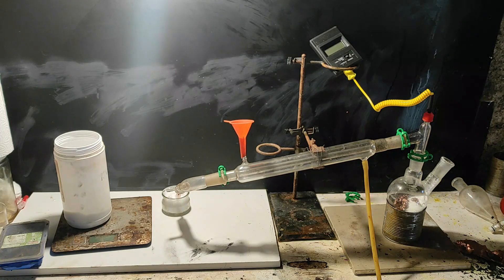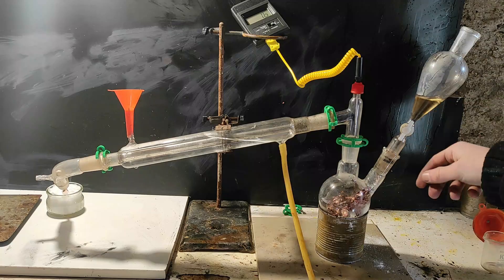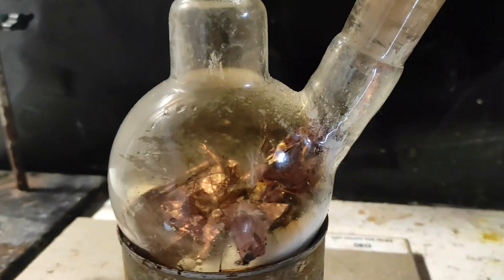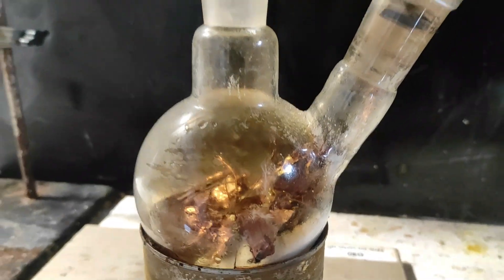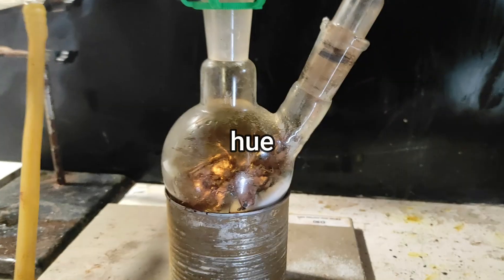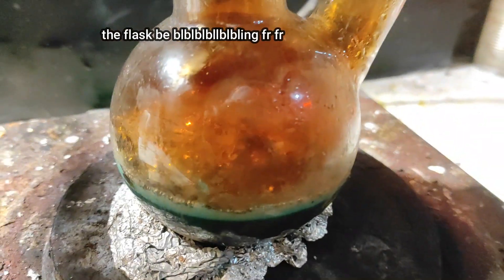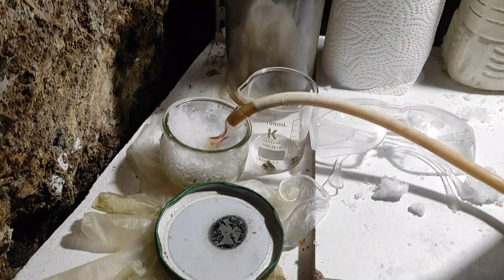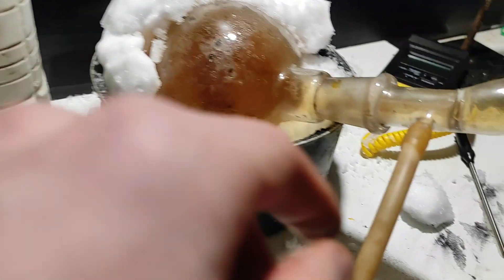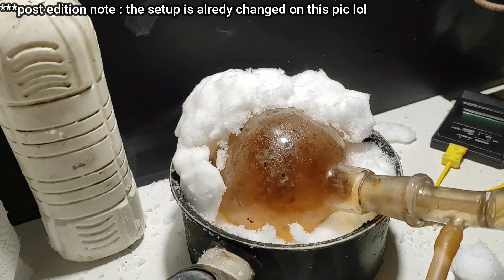I loaded up the flask with copper and potassium nitrate, and added slowly the concentrated sulfuric acid with the addition funnel. Okay, yeah, so it's working — as we can see, it's a little bit brown. The reaction was somewhat working and I got some bubbling, but not a whole bunch. So I tried heating the mixture with the hot plate, and it still wasn't good enough. So I decided to change the setup.